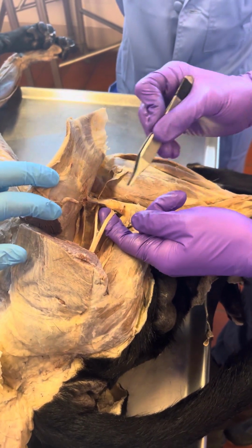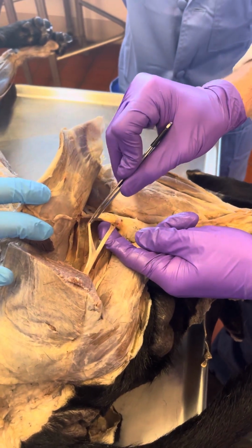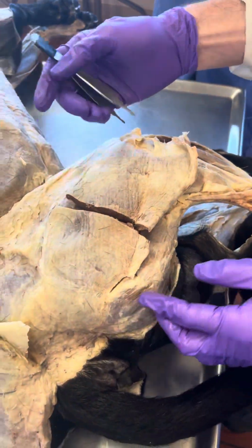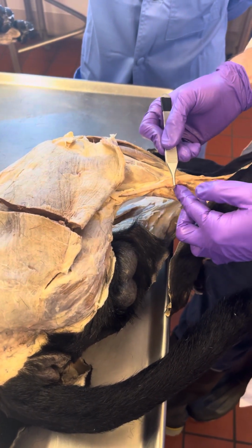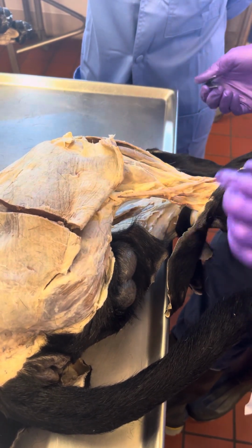So one nerve turns into two? Yep, sciatic branches into two. Common fibular and then tibial. Okay. And then still here on the lateral side of the limb, we have our lateral saphenous vein, and that branches into a cranial and caudal branch. Okay.